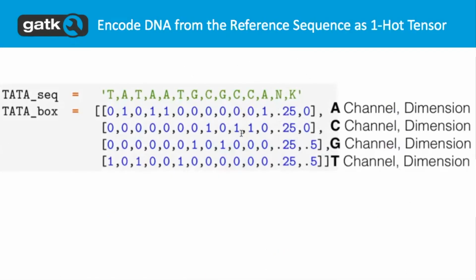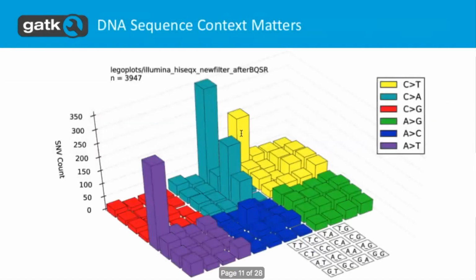And this kind of soft thresholding applies only for the SNPs, not for any INDELs. I'm sure similar things happen for INDELs, but this diagram is only for SNPs.